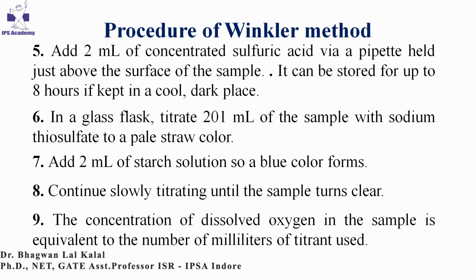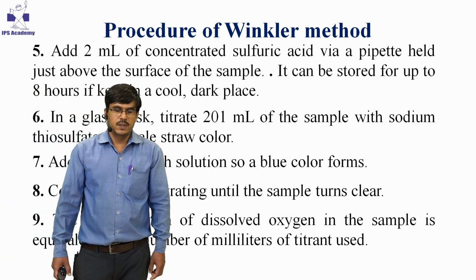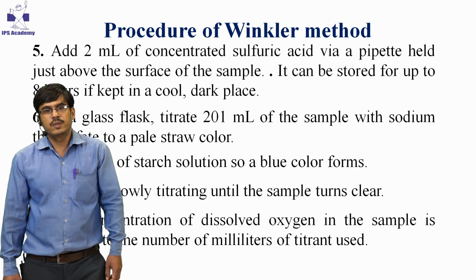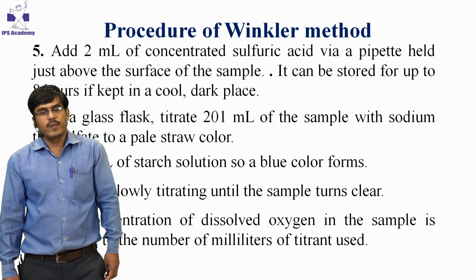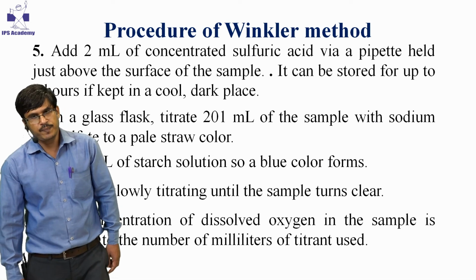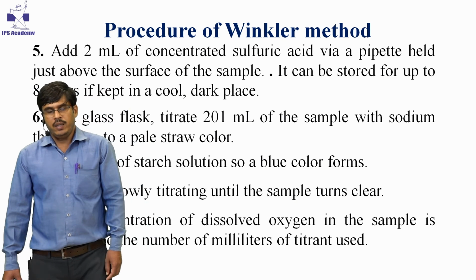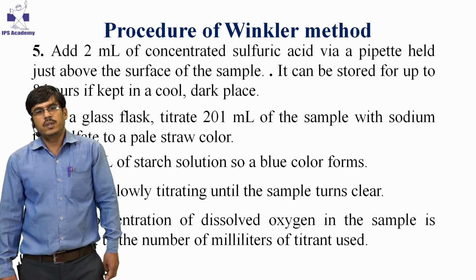Practically, the parameter is set in such a way that the volume of hypo used in the reaction will be a direct indication of dissolved oxygen.